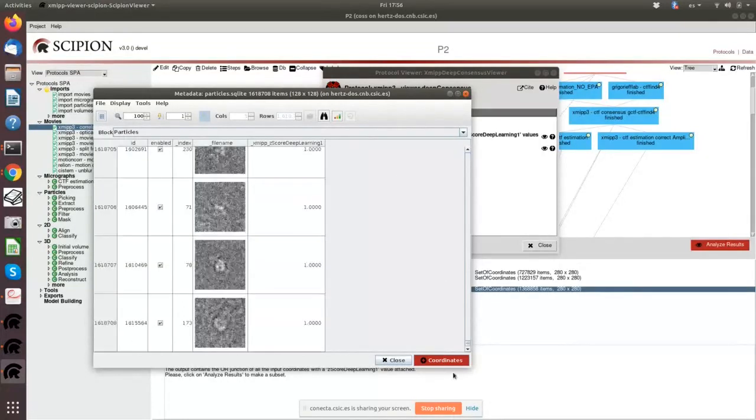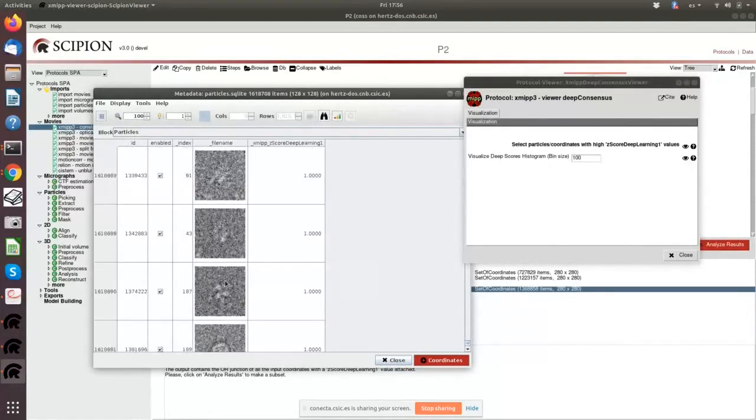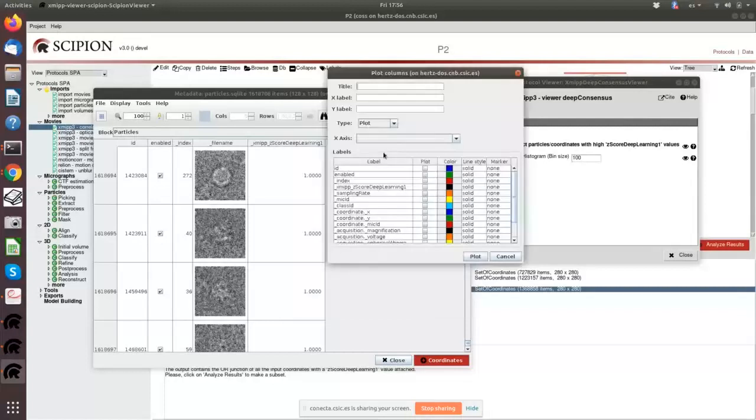And if you go to the other end, it believes that there is a particle. It doesn't mean that it is your particle, but there is certainly something there. And if these are contaminations or things that you don't want to keep, you would have to clean them later. And what we have found useful to choose this threshold is the following.